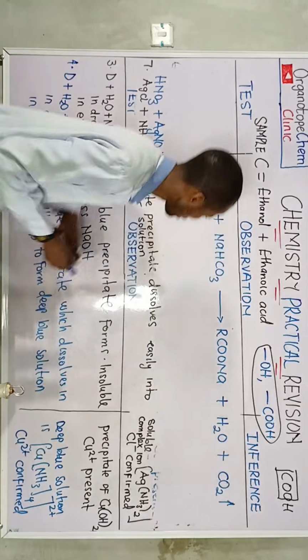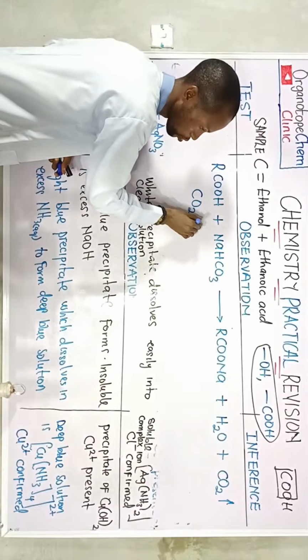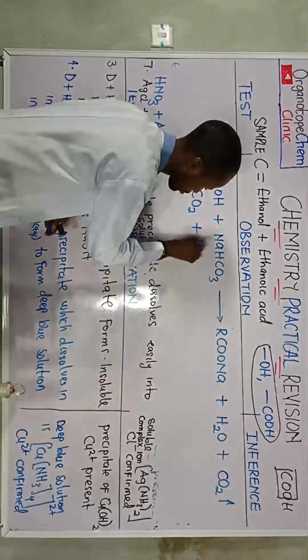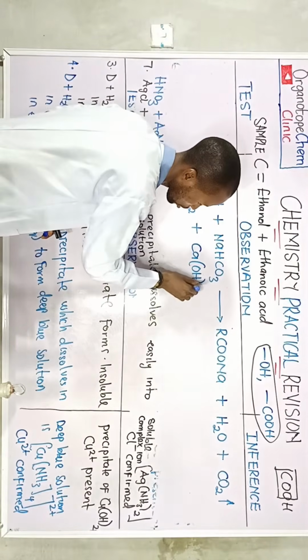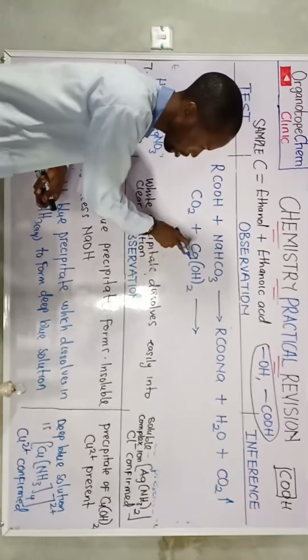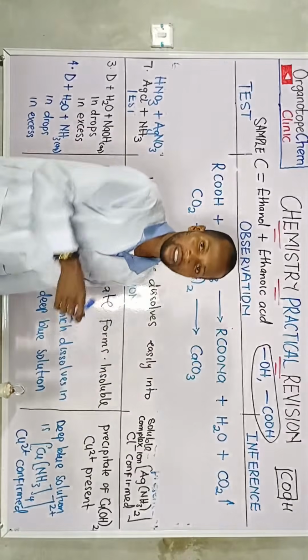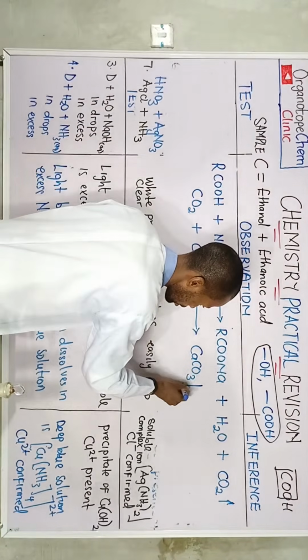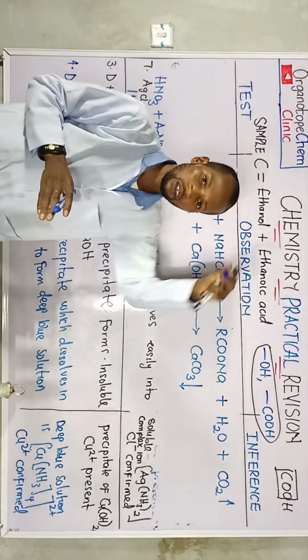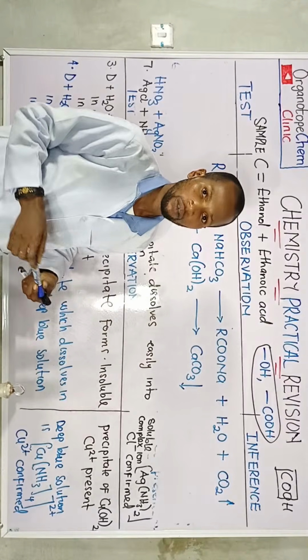So the gas evolved here was passed through what? Lime water. Is that taken? So the complete equation right here is CO2 plus the calcium hydroxide, which you've stated as what? Lime water. We have Ca(OH)2. Okay? Now this results in what? The calcium hydroxide here tends to form carbonate, CaCO3. Are you getting it? So it is a precipitate. Okay, that is the milky solution that we're having. That's the milky solution that we saw in the reaction.